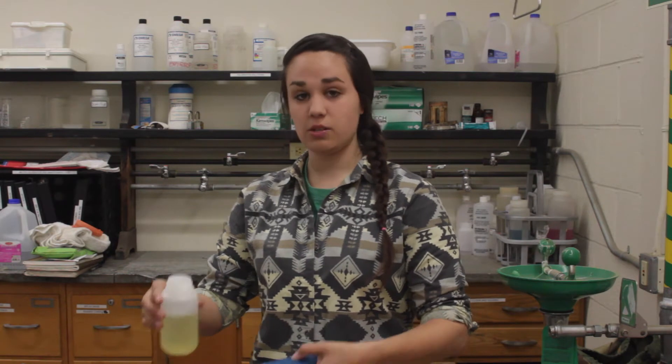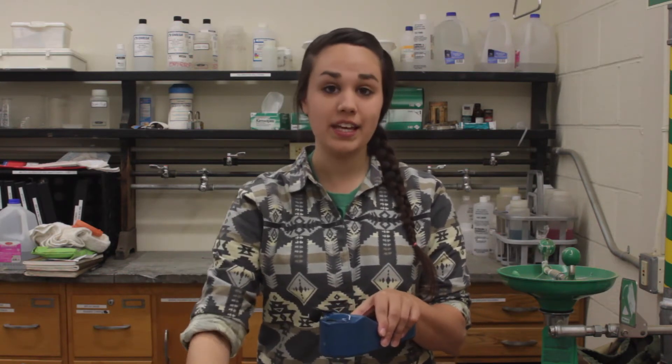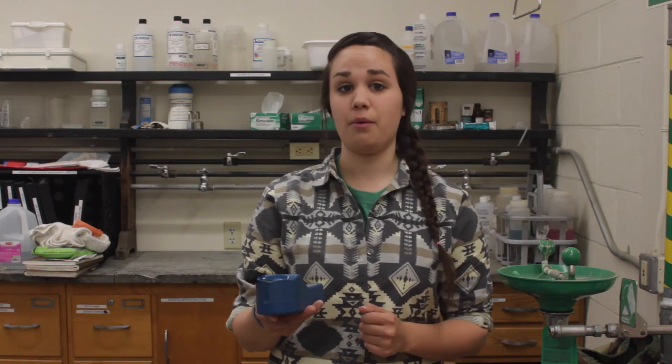Once we finish the triple rinse, we can fill the wells with that same neutral solution and push the pH button on our meter. If our meter displays a pH of 7.00, we don't need to calibrate. Right now, my meter displays a pH of 7.15, so I need to complete the calibration process.